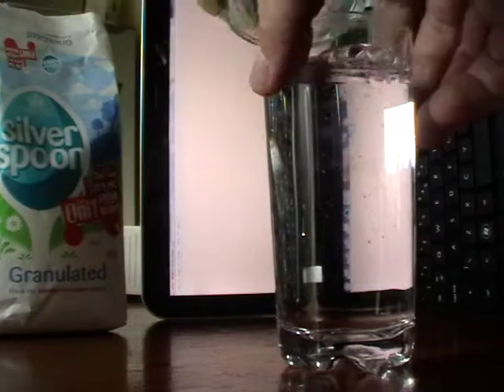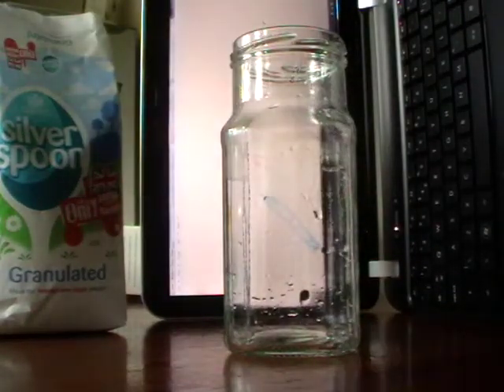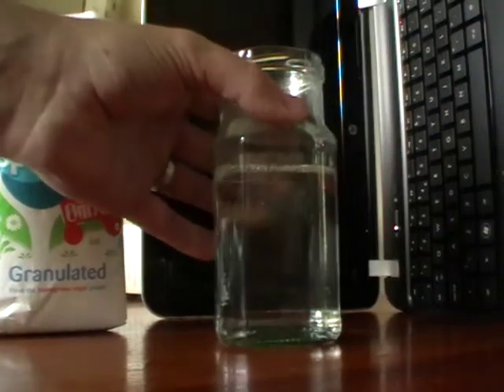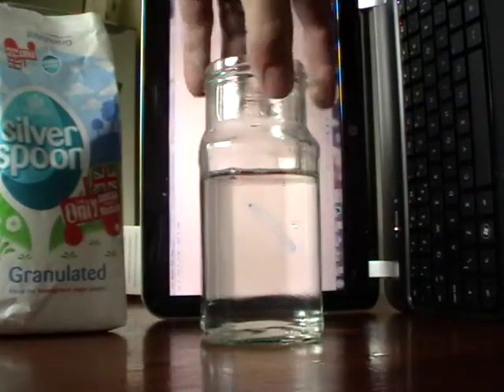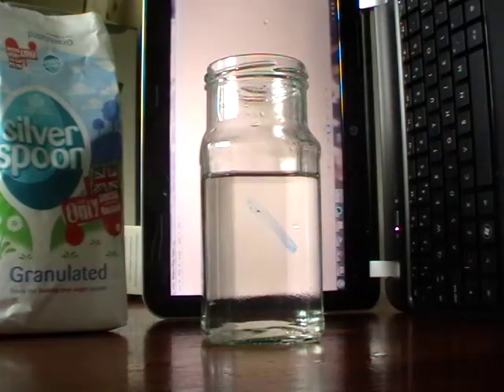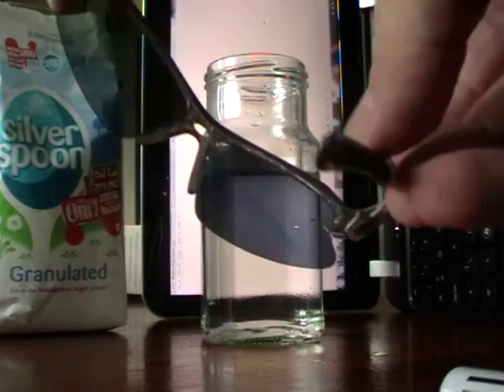I'll just get my shoddily made sugar solution. Just use a stack of sugar — the more you use the better rotation you'll get. Put that in there. I just noticed my laptop's gone to sleep, which is good. So this is now the sugar solution. Now we put the glasses in.